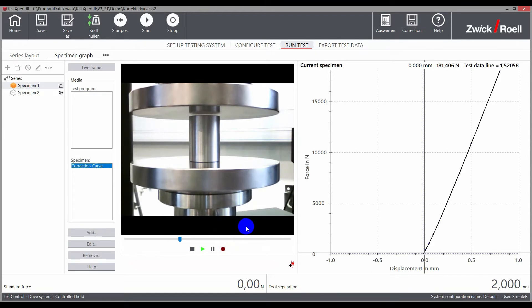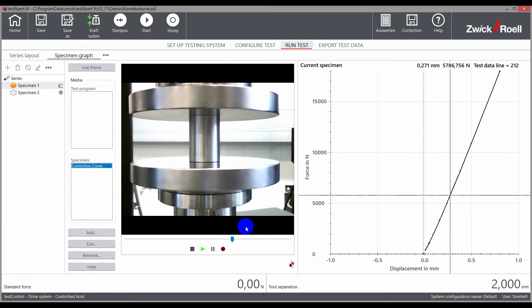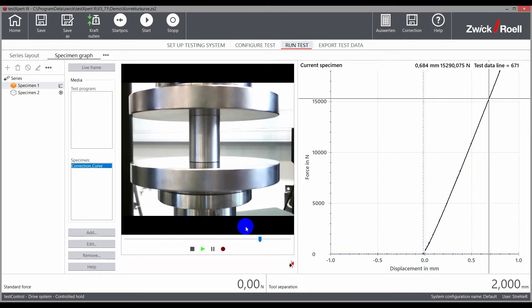A solid steel cylinder is placed between the compression platens and the machine is loaded up to nominal force. The deformation that is measured corresponds to the deformation of the testing machine, the load cell, and the used compression platens.